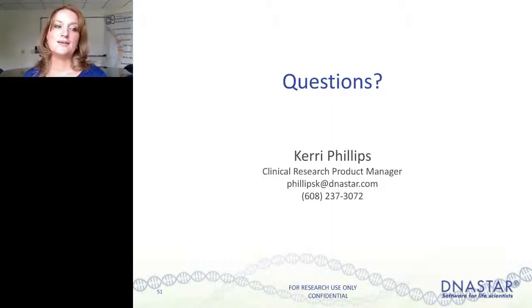So I got a question here about software being available for clinical use. DNASTAR software is for research use only. It is not approved by the FDA. So thanks for that question, but at this time DNASTAR software is for research use only.